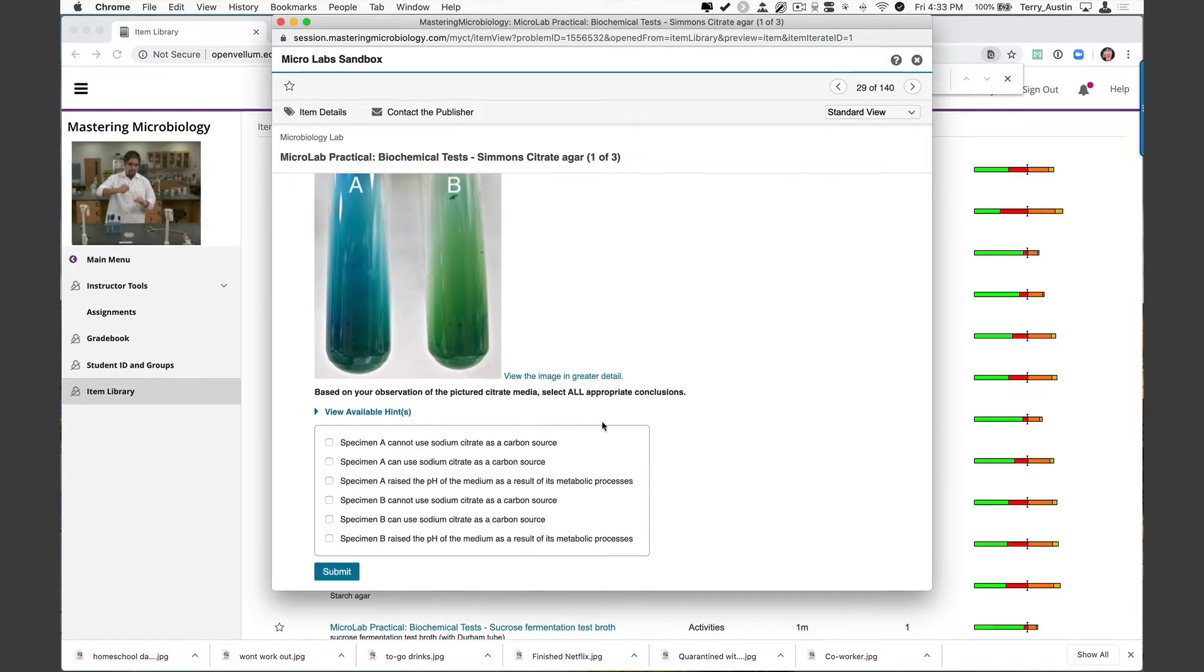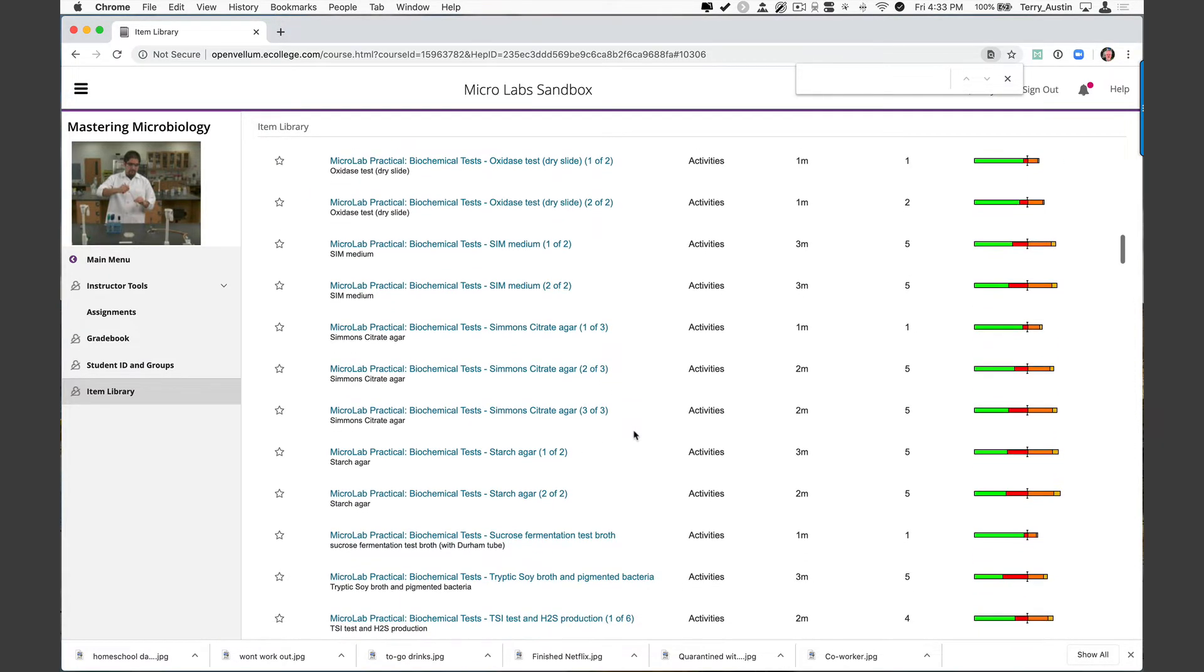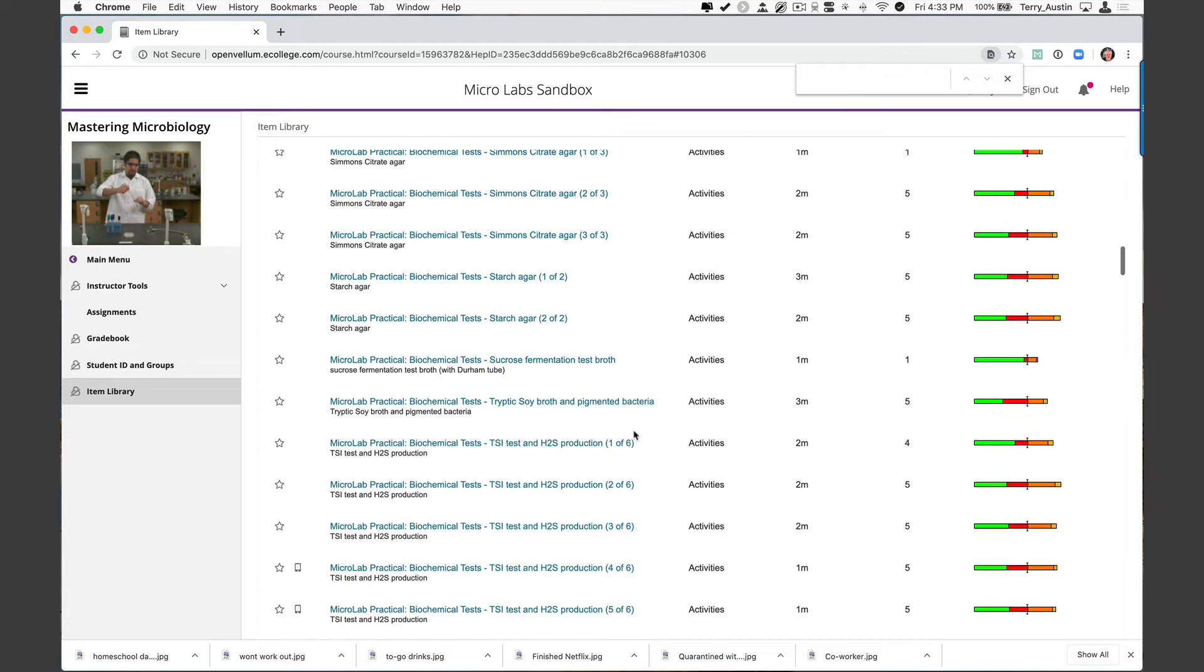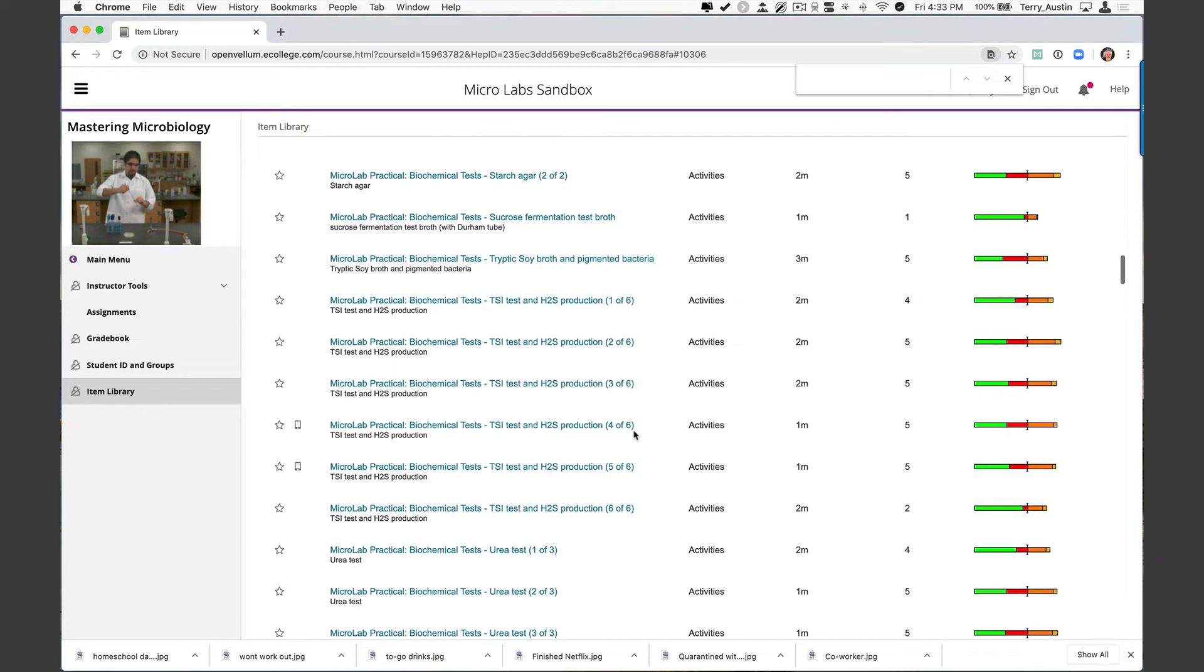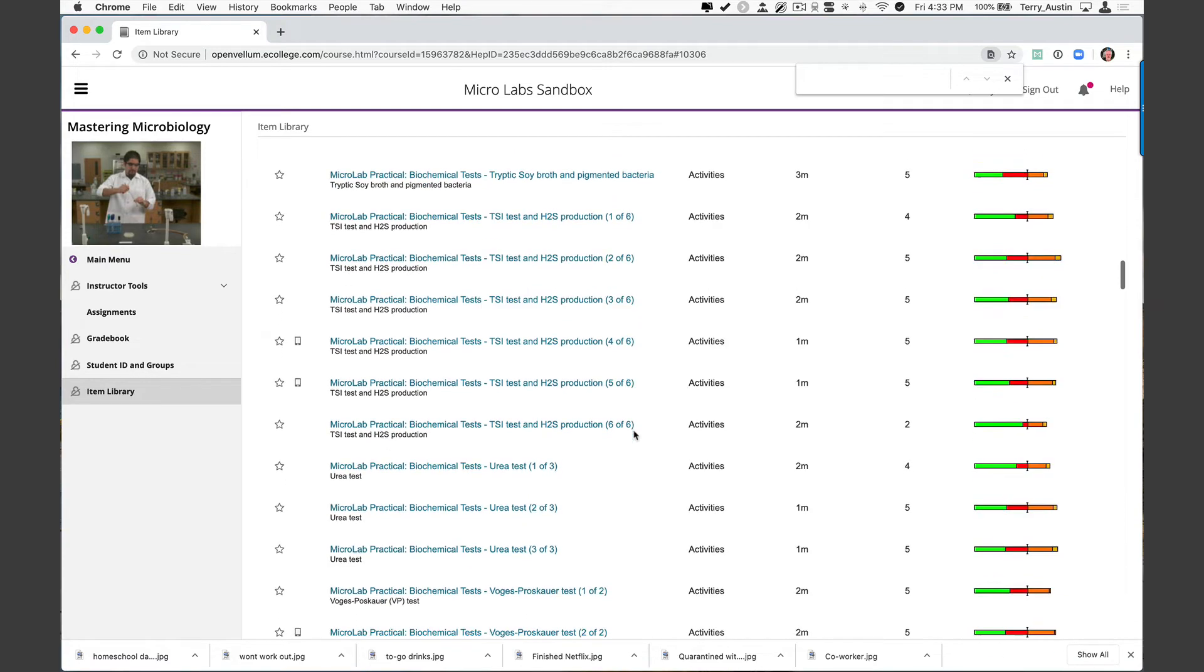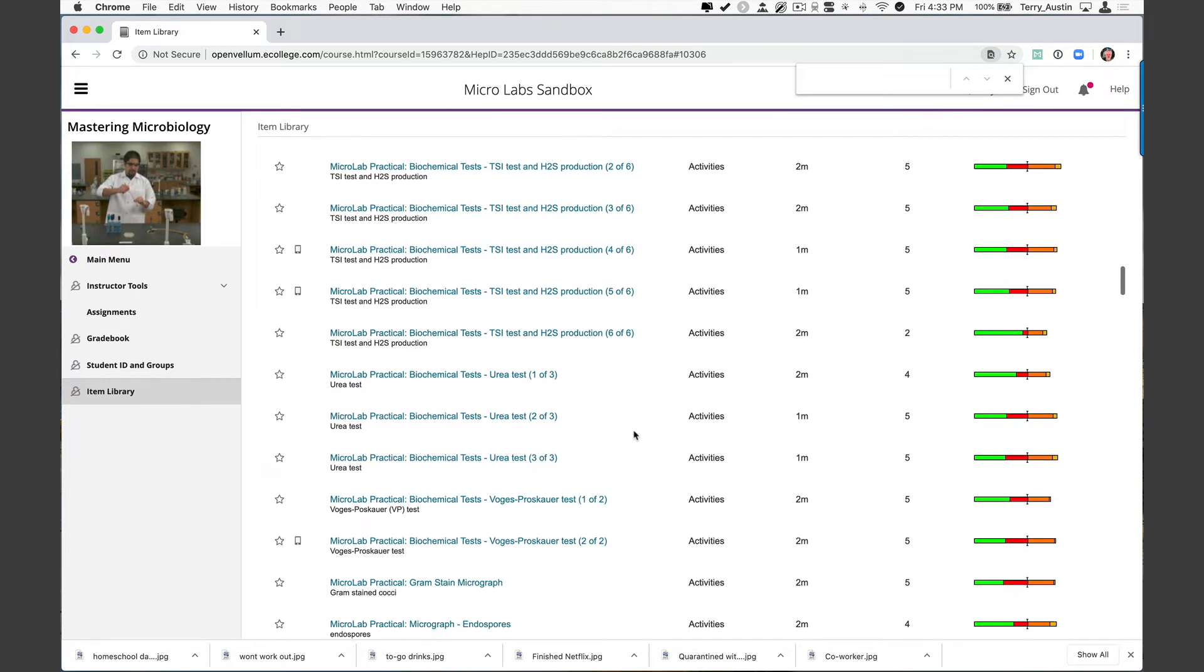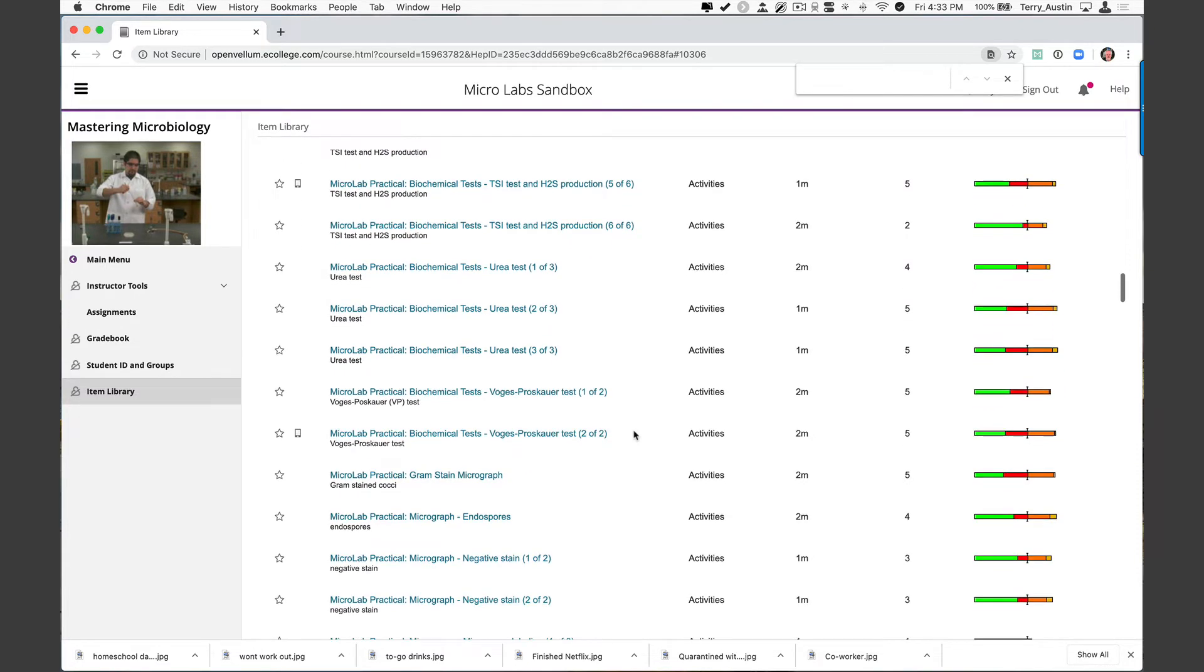And your students are asked to select all appropriate answers here based on the behavior of organism A and organism B on this media. I'm going to close that and you can take a quick look at all of the biochemical tests that are available here. I'm not going to read them all but you get Simmons citrate, starch, sucrose fermentation, TSB with pigmented bacteria, triple sugar iron, urea test, Voges-Proskauer. Lots of those. So they're here. They're all kind of set up like that showing students the results and asking them to interpret.